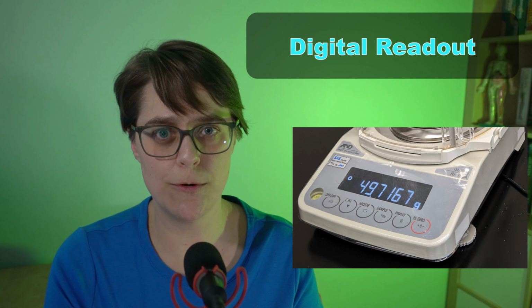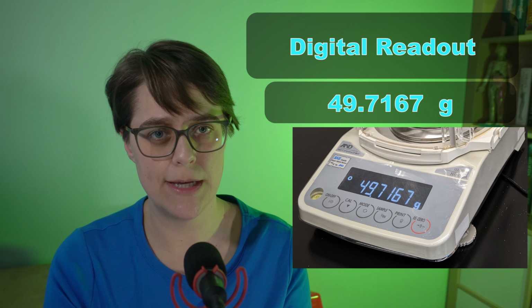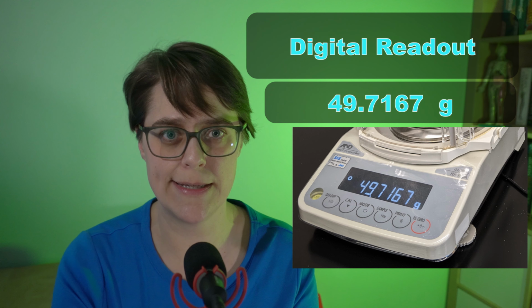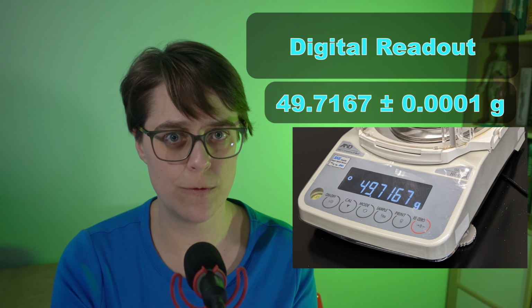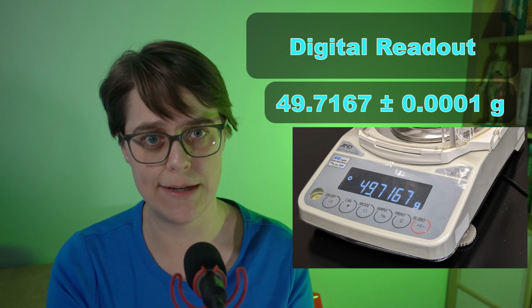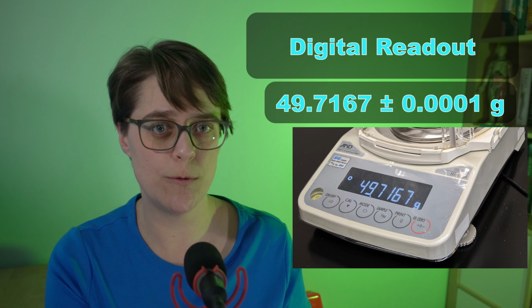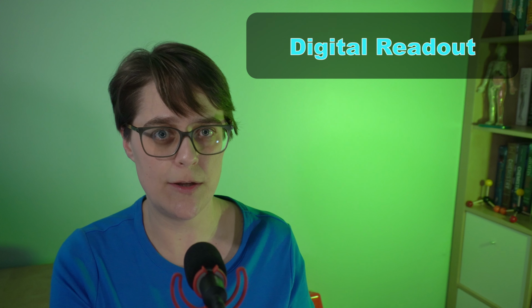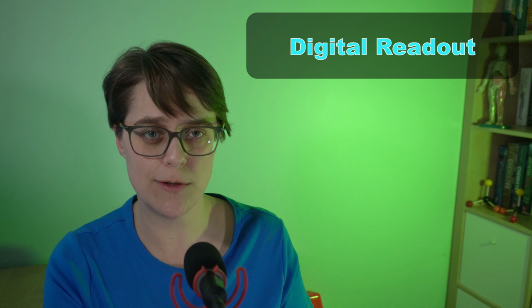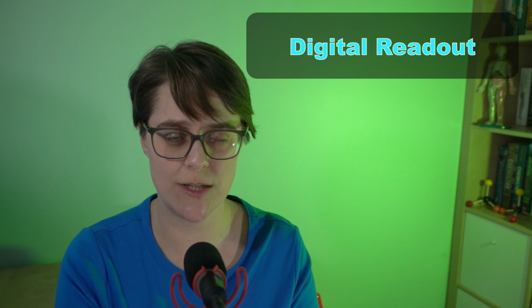If an analytical balance reads 49.7167 grams, assume the uncertainty in that last digit. So 49.7166 to 49.7168 grams. Some instruments specifically give you different uncertainty, and you should use that uncertainty if that's the case. Otherwise, assume plus or minus 1 for that last digit.